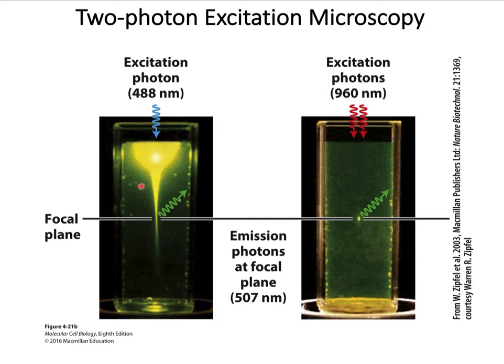So that background will interfere with the emission spectrum from that single plane of focus, even in the presence of a pinhole of the confocal microscope, which is supposed to cut out of focus light. It is just a limitation of the instrument in case of a thick sample.